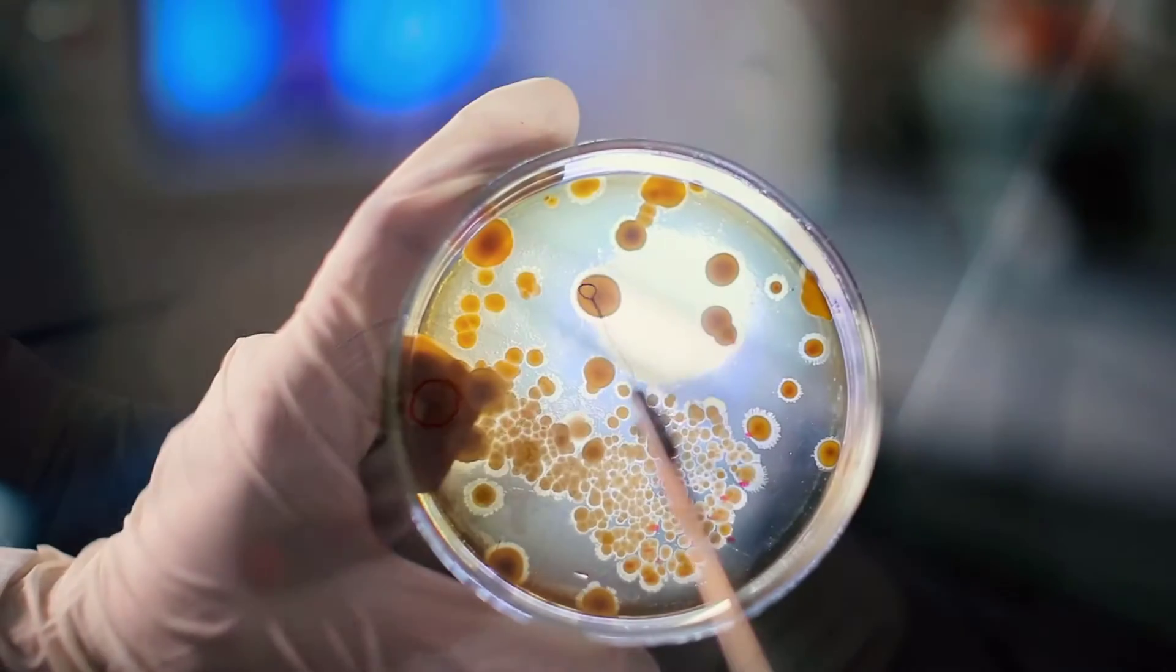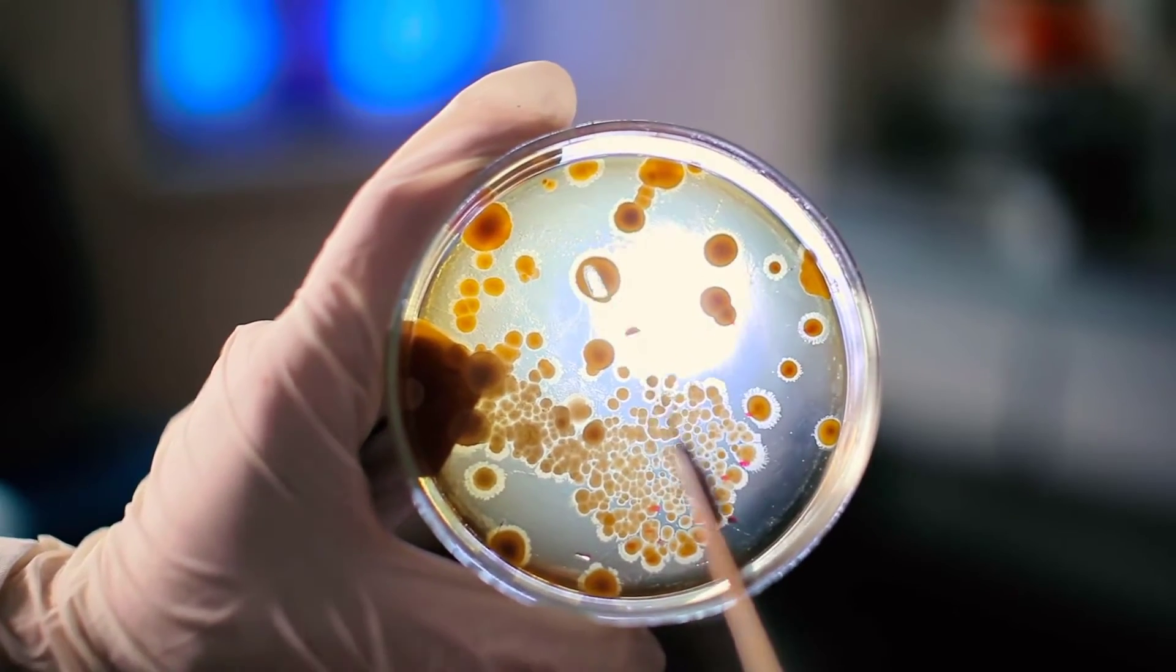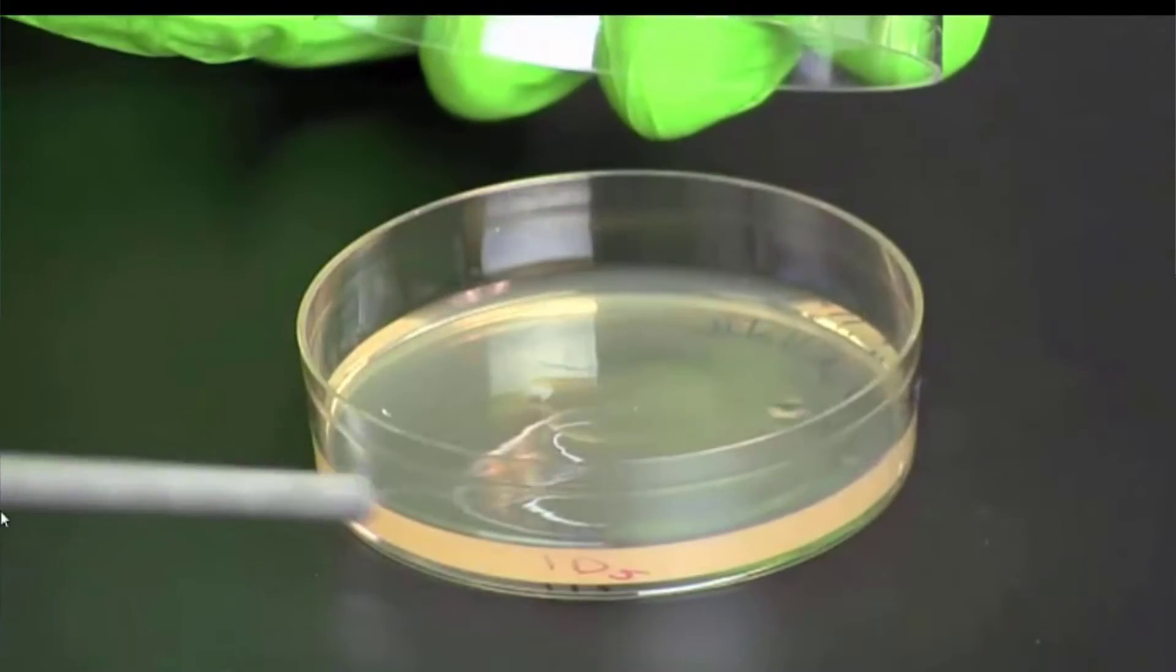Pure cultures can be obtained by picking well-isolated colonies and re-streaking these on a fresh agar plate. Biochemical tests are used to identify bacteria. These tests are only valid when performed on pure cultures.